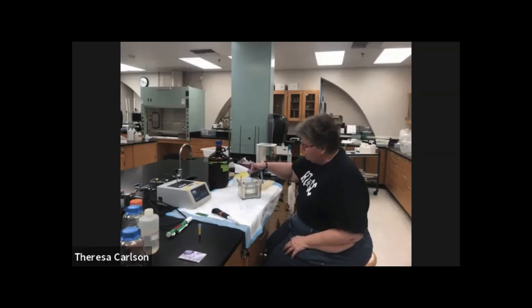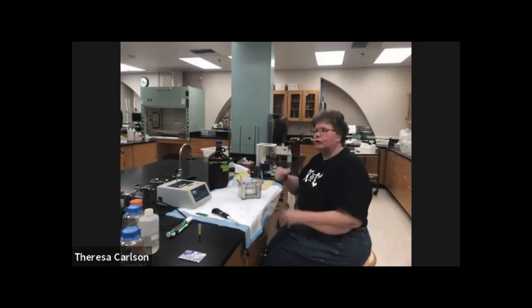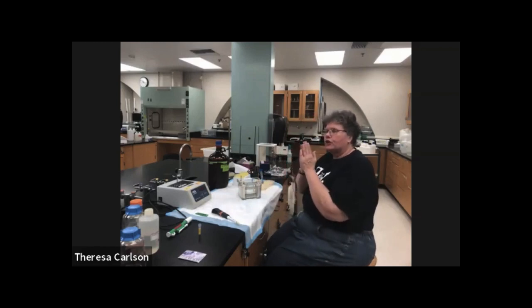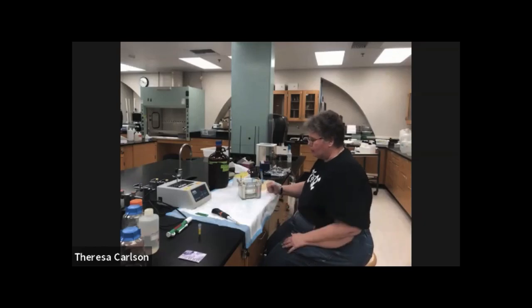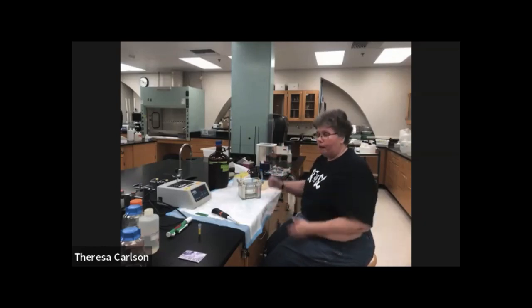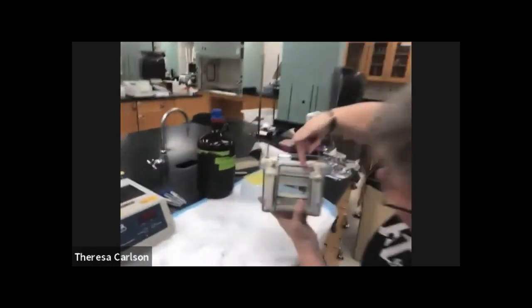So if this is your first time that you have ever loaded a gel, doing something like this can help you visualize where the wells are, because otherwise you're looking at a clear gel and clear buffer through clear plates, and it can be very, very difficult to actually see the well. Now, you don't want to add too much sample buffer because you don't want to fill up your wells with sample buffer and no protein. You're just adding a tiny, tiny bit to outline the wells and allow you to see them.